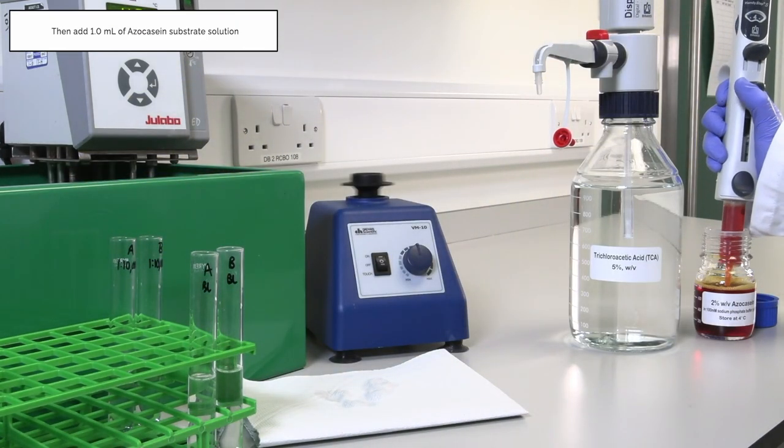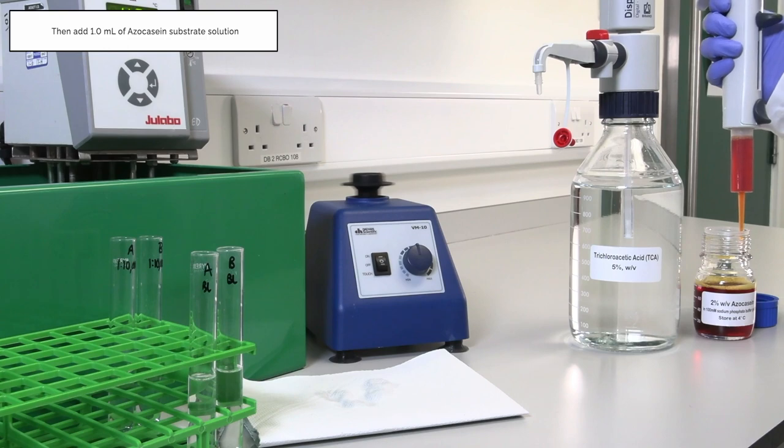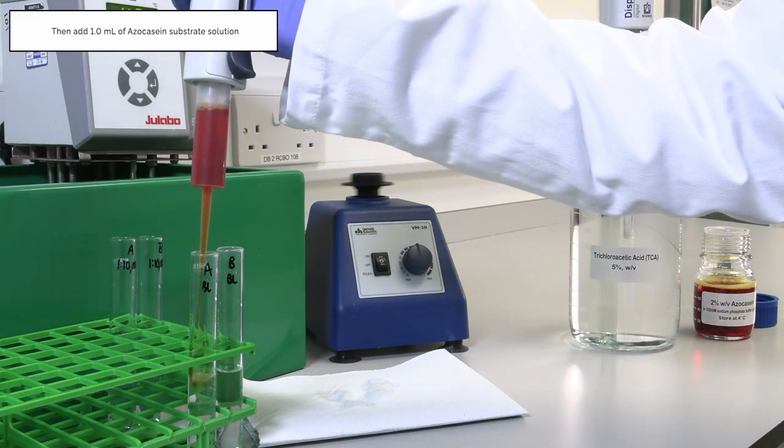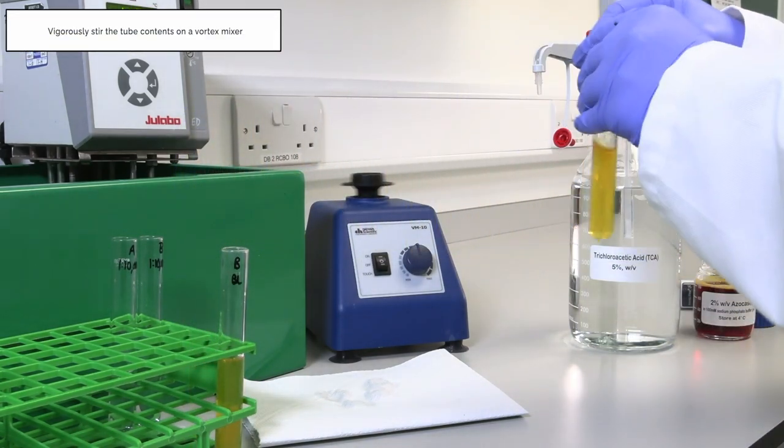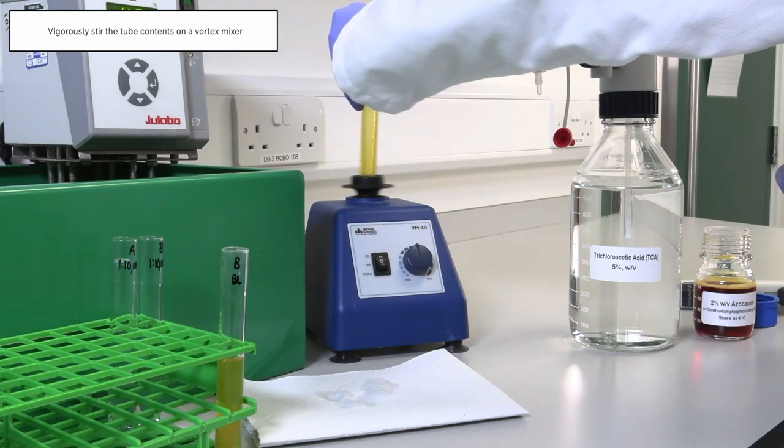Then add 1 ml of the azo casein substrate solution and vigorously stir the tube contents on a vortex mixer.